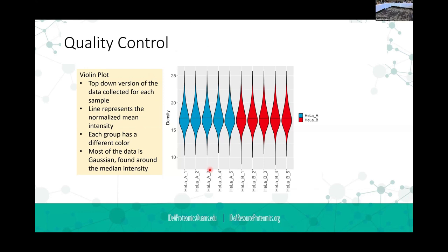Yeah. If we have not taken equal amounts of protein, we may end up, you will be able to see it here. We have taken equal amounts of protein during the experimental time, and we may get equal normalized data, or we may still get unnormalized data.